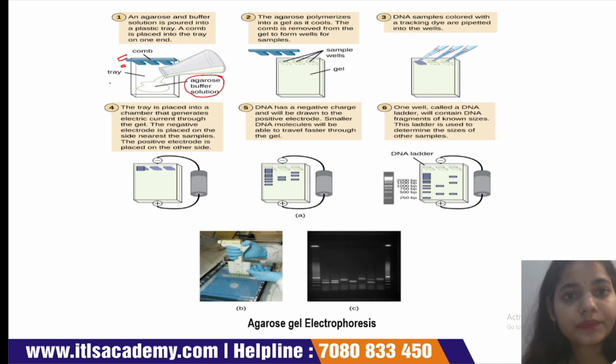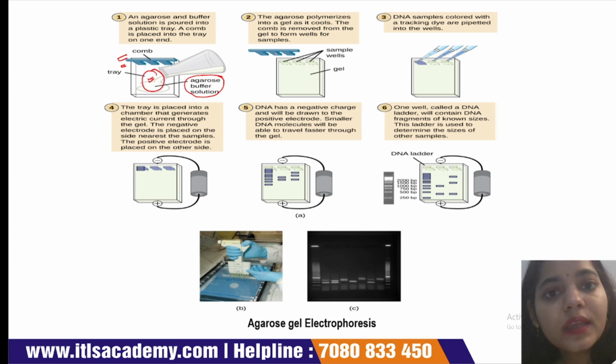After our solution cools down and the agarose gel solidifies, we remove this comb. After removing the comb, we easily see these wells.